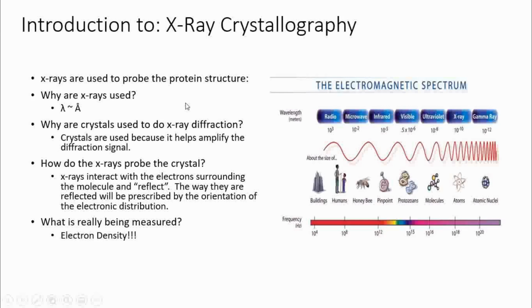Now the x-rays will go to this lattice, or basically we are saying a crystal, a crystal of the protein, and in this crystal it will experience different diffractions. I'll come to all of these points one by one. Depending on the patterns of diffraction, which again depends on the lattice structure, you collect this diffracted x-ray onto a detector, and the spectra is drawn. From the spectra you get two pieces of information: the intensity of x-ray which you are experiencing, and the angle of diffraction. Based on these two things, the spectra will fall into one of these categories.